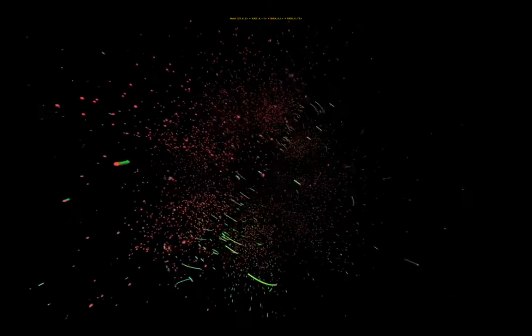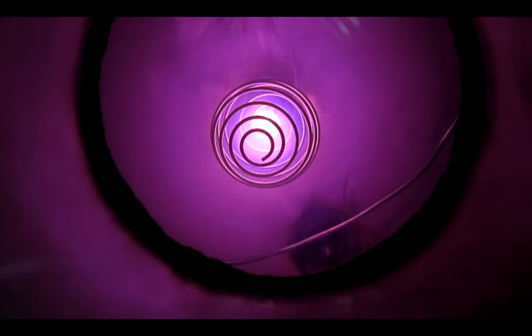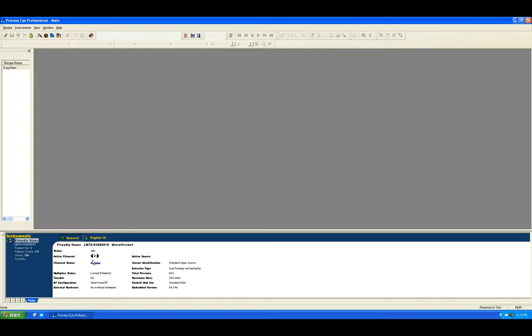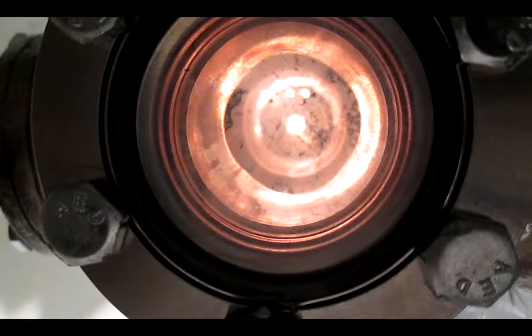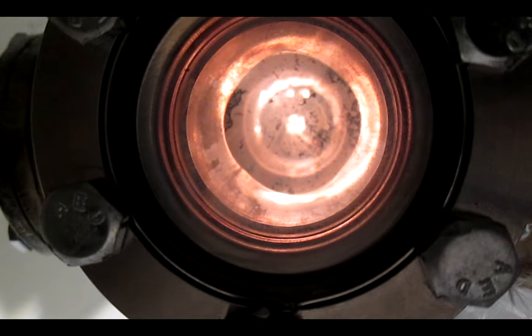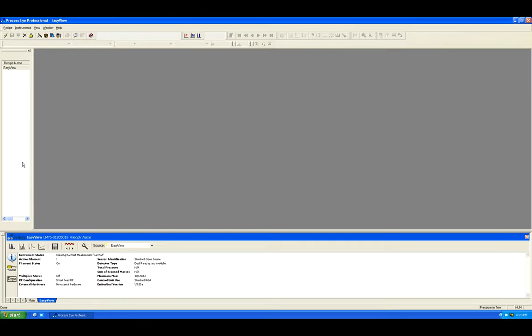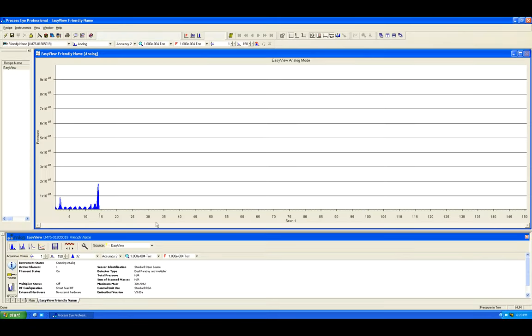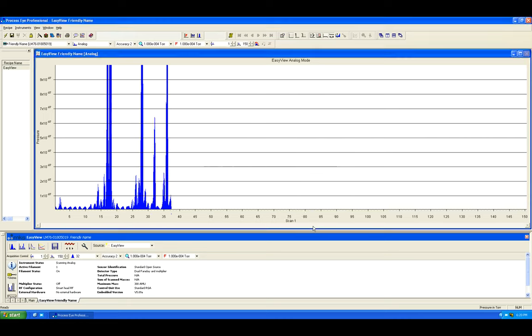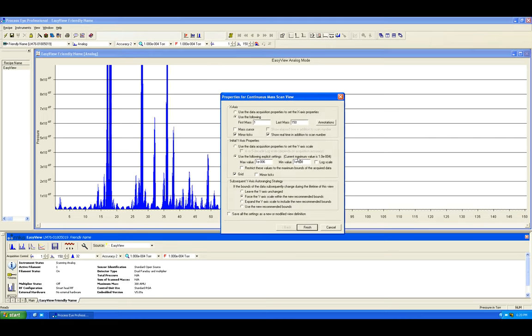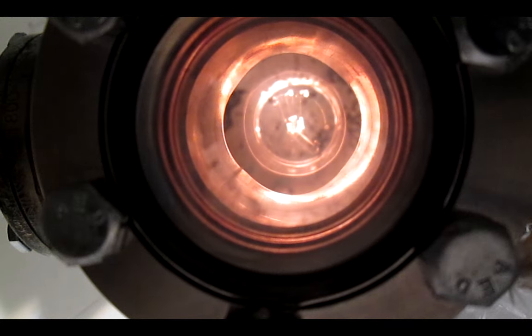And to create them, we can use a multitude of techniques like high voltage needles, plasma, lasers, etc. In our case here, we have a set of filaments releasing electrons continuously, like the hot cathode of an x-ray tube. The current passing through the filament can be set in the software.